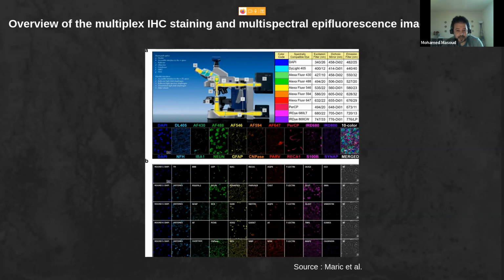And actually, this does not come in a single channel. Every channel represents a marker, and you will have a stack in the end. This stack has multiple channels, like here 10 channels, for example, and the image processing can extract each channel alone, or mix or fuse different channels in order to give you more insight into the data.